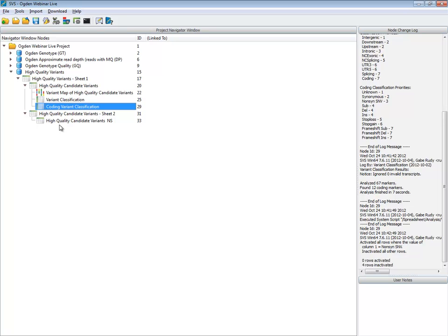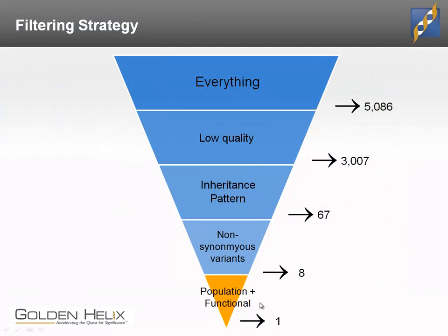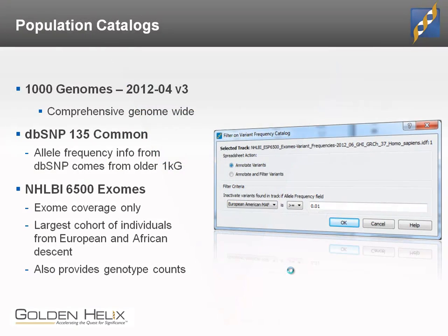Let's look at our next step, which is to pull in functional and population information. I'm not going to spend too much time on this, but there are definitely choices here on what type of population information we want to use. When I say population information, we want to ask: this is a variant, but does it exist fairly commonly in the population of humans as a whole, or within the individual ethnicity I would expect to compare against?